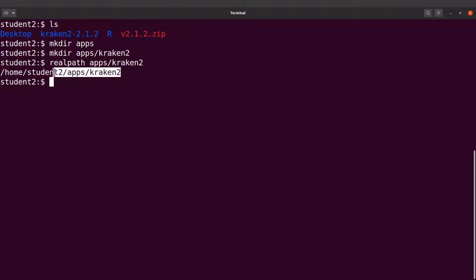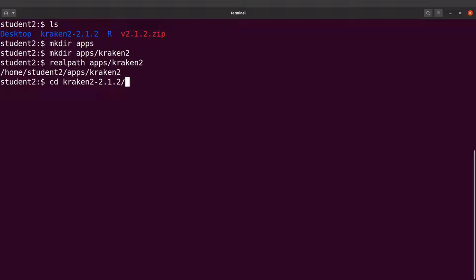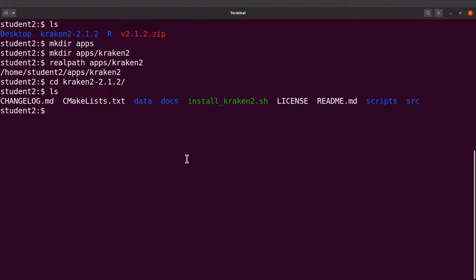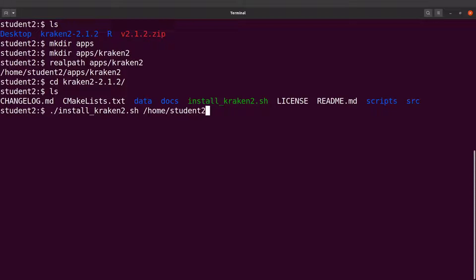Now let's CD to the source code directory: cd kraken2-2.1.2. Let's do an LS inside this directory. We are going to execute the install script — dot-slash install_kraken2.sh — and then specify the path. I'll supply the full path: /home/student2/apps/kraken2. I'll now execute the script.